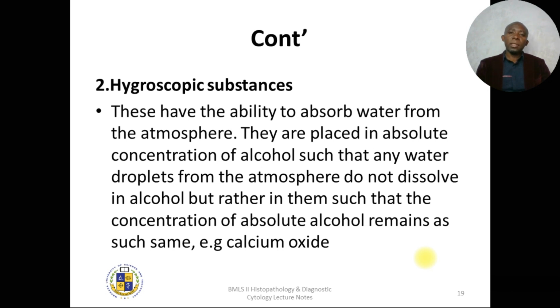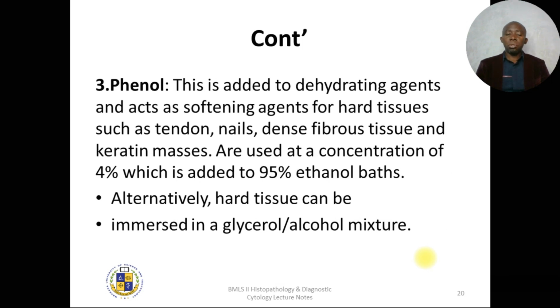How they act is that they are placed in absolute concentrations of alcohol, such that any water droplet from the atmosphere does not dissolve in alcohol, but rather these hygroscopic substances absorb them, such that the concentration of absolute alcohol remains the same, e.g. calcium oxide. So they also help to maintain the concentration of alcohol.